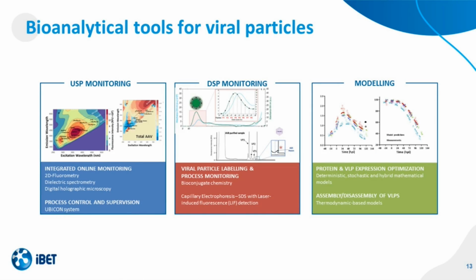Today I will be more focused on analytical tools for virus quantification, but we have several for upstream and downstream processing monitoring, as well as modeling.